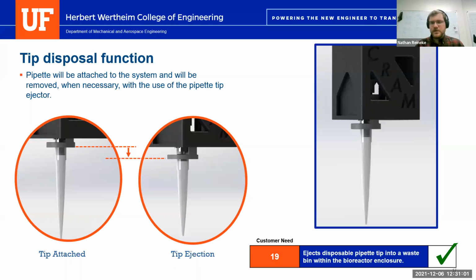So the tip ejection is automatic. When Mateo was talking about manual, what he means is, from our understanding of our criteria, the pipette system itself would move to a location where the pipette tips are housed, and they would be housed linearly, and the whole apparatus would go down and interface with that next pipette tip and then go on its way.